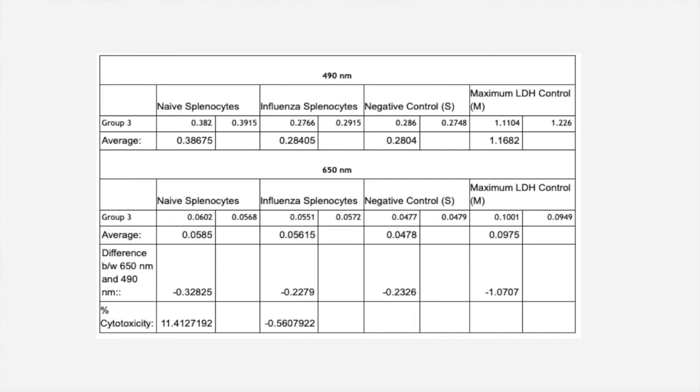This negative value indicates that we didn't have CTLs present. An explanation for these findings could be due to the fact that the mice inoculated with the virus were only exposed for 1 week. It is possible that a proper adaptive immune response wasn't formed, thus the lack of cytotoxicity.